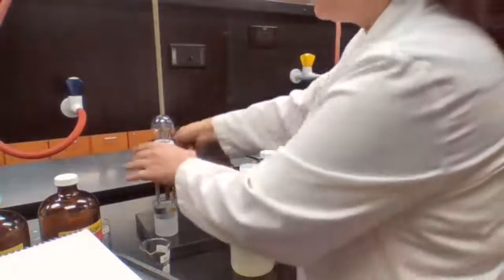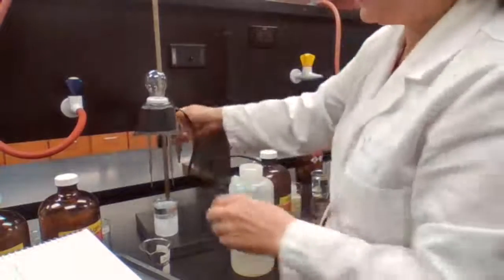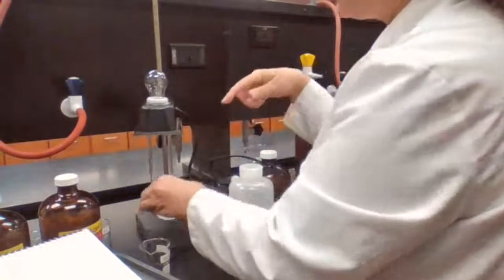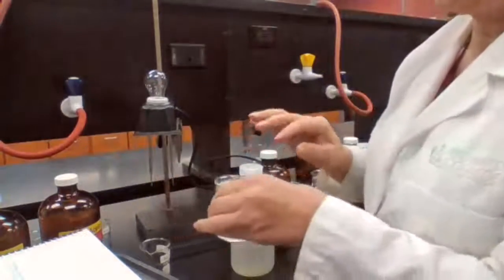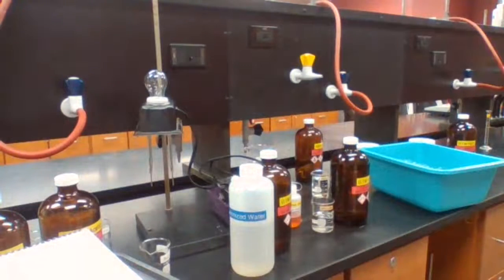The solvent should be able to dissociate the ions of your compound. So toluene was not dissociating, but water was dissociating them. I'm going to place it in the fume hood because toluene has a very strong odor.